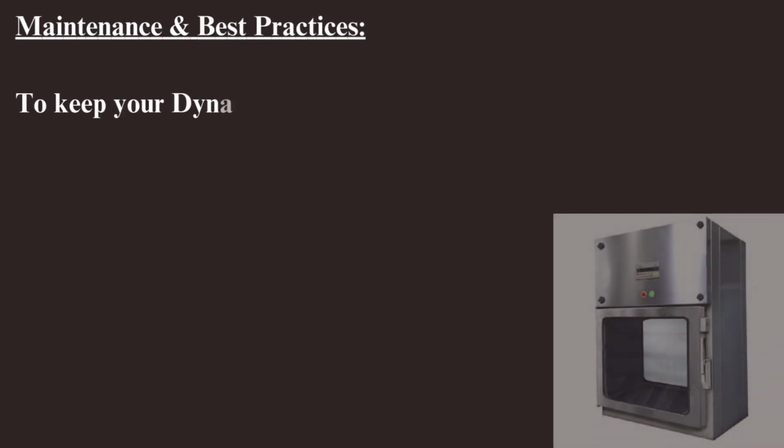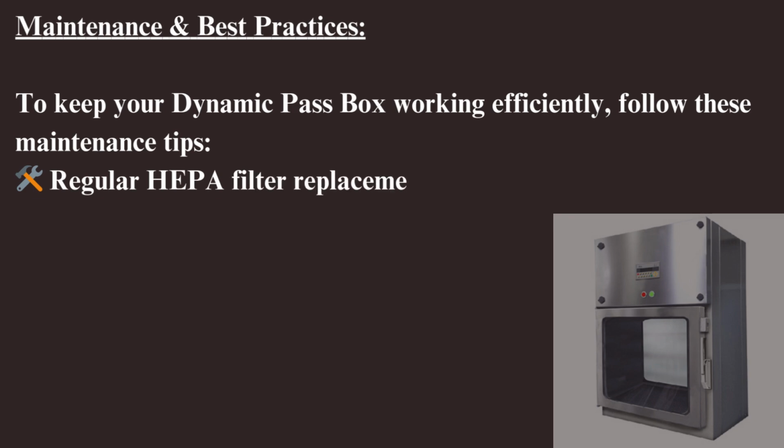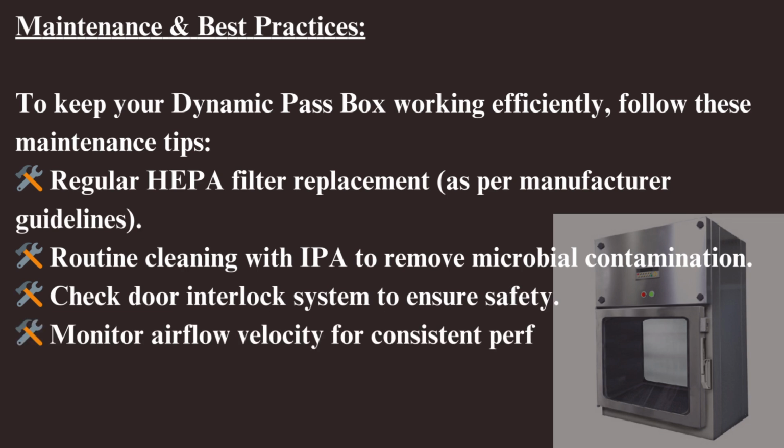Maintenance best practices. To keep your dynamic passbox working efficiently, follow these maintenance tips. Regular HEPA filter replacement, as per manufacturer guidelines. Routine cleaning with IPA to remove microbial contamination. Check door interlock system to ensure safety. Monitor airflow velocity for consistent performance.